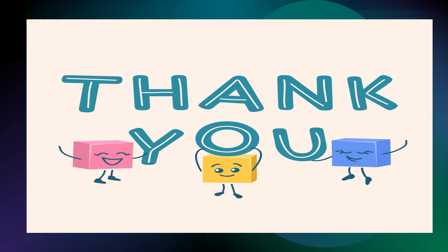This is all about the calibration of the Karl Fischer titrator. I hope you understood the procedure. Thank you.